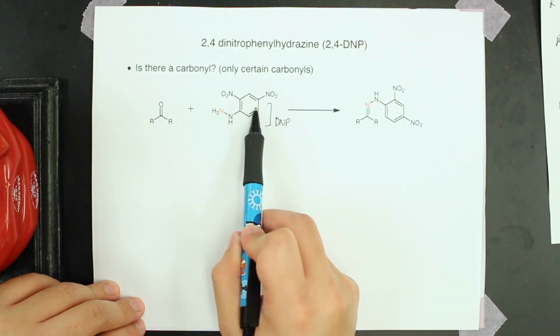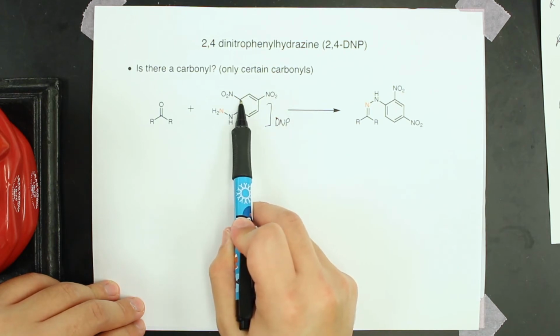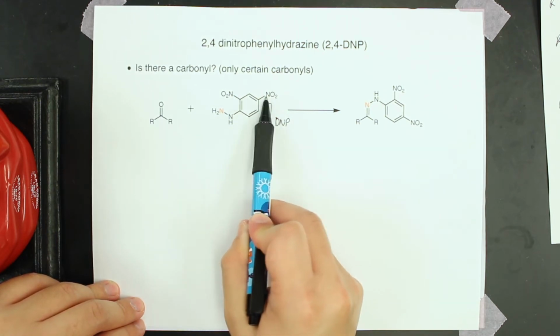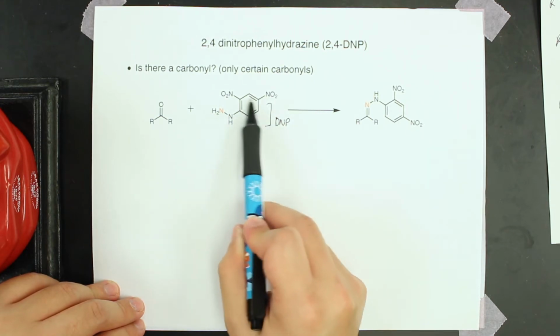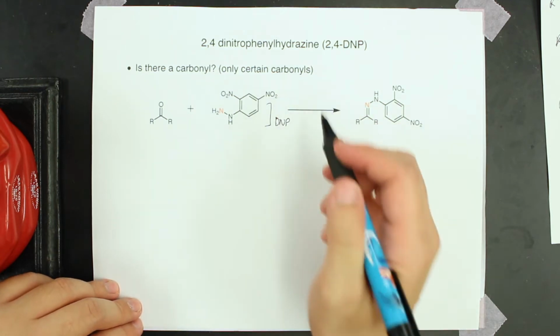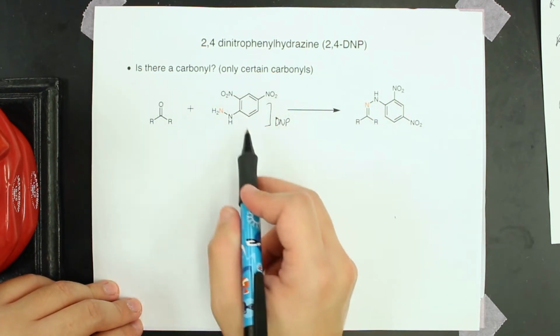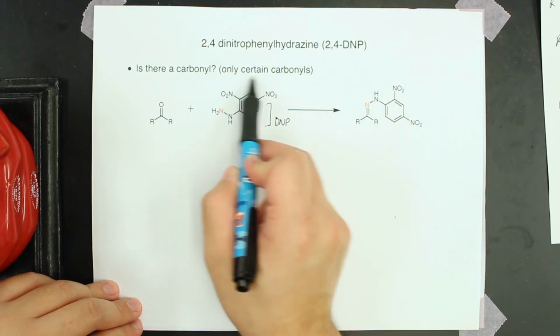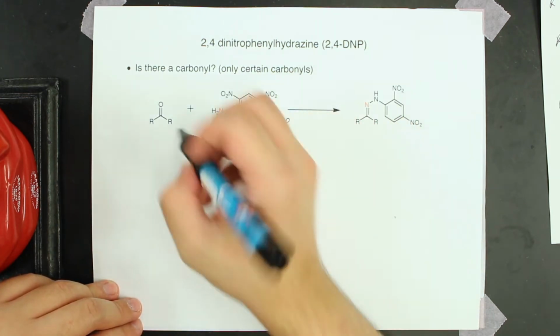So if you have 2,4-dinitro, this is the 2 position, it's 1 carbon away from this carbon, and then 4. So 2,4-dinitrophenylhydrazine. Phenyl refers to the ring. Okay, so this DNP group will actually react with carbonyl compounds. So the question we're asking ourselves is, is there a carbonyl? And as you'll see, it's only certain types of carbonyls.